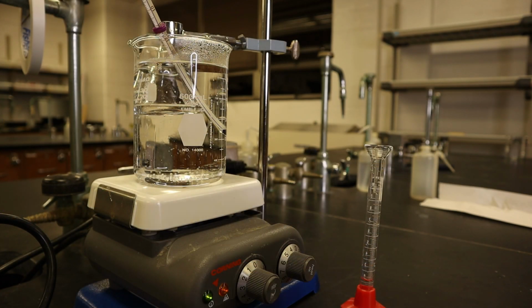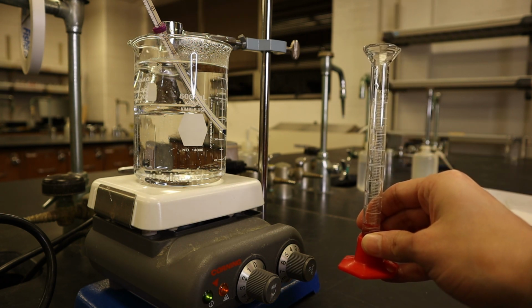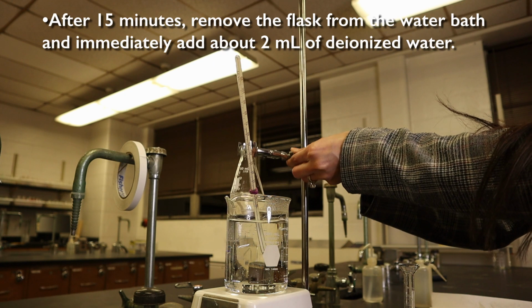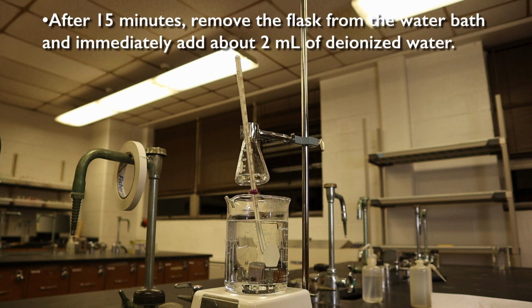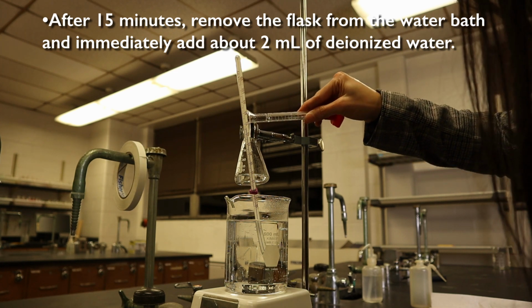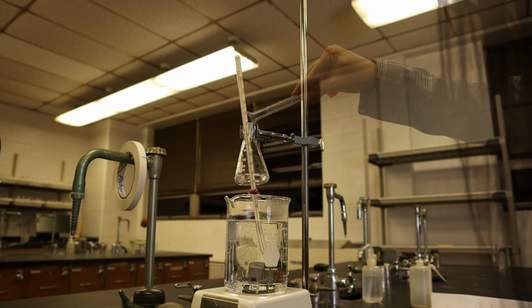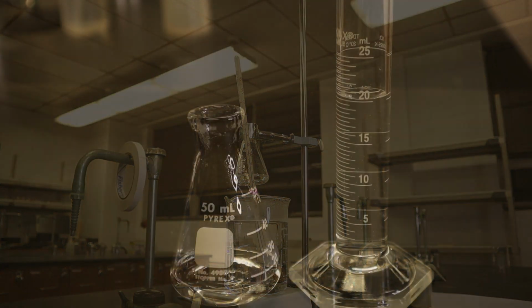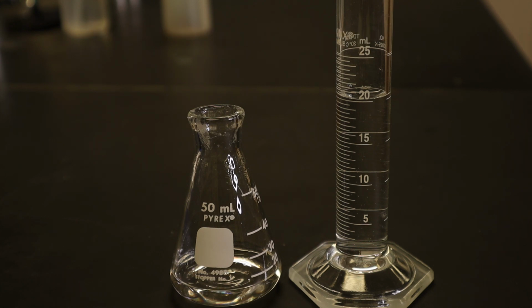After 15 minutes, I'm going to be removing the 50 milliliter Erlenmeyer flask from the hot water and I'm going to be adding 2 milliliters of room temperature deionized water. The water is going to decompose any excess acetic anhydride. We're going to let the flask cool down for a few minutes and then we're going to add 20 milliliters of water.